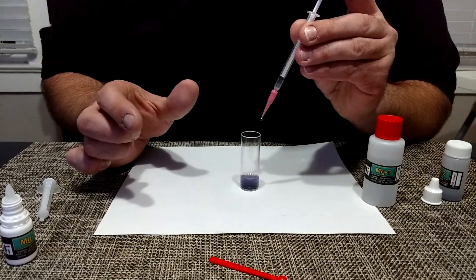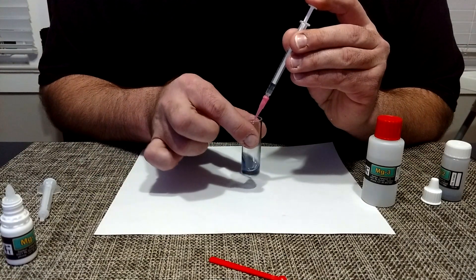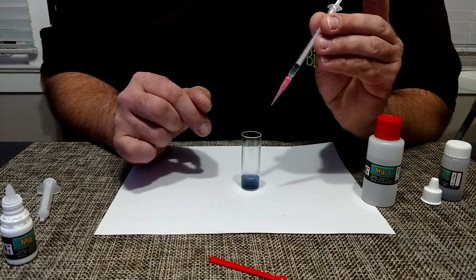It's starting to change colors — we're at a purple right now. One drop. That is blue.